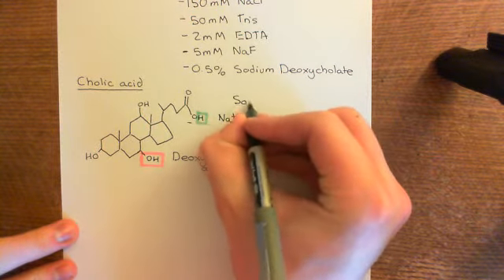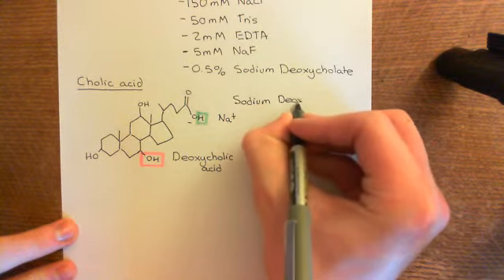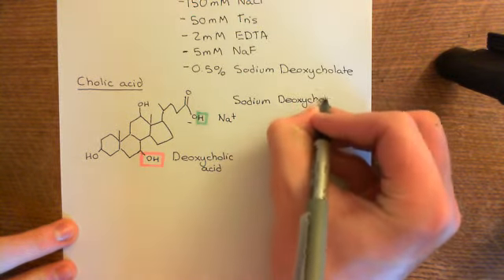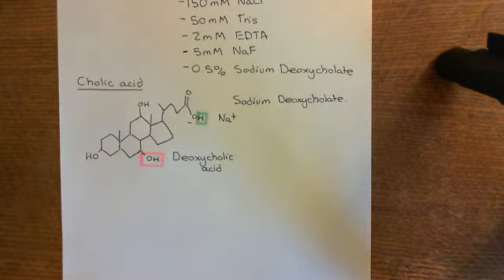Okay, so this will be sodium deoxycholate. Okay, right. So, next up then, sodium deoxycholate is one of the key members of the cold lysis buffer, but there is one other very important member, which is a detergent molecule.